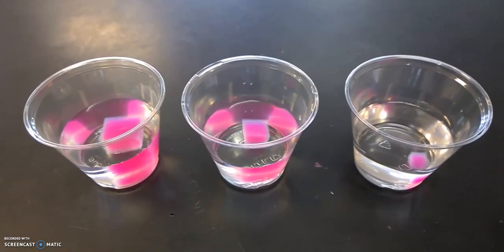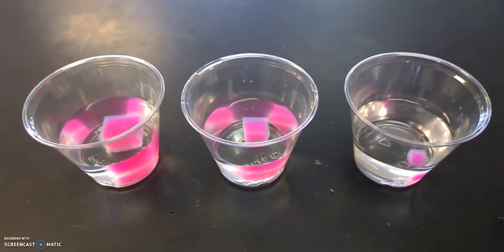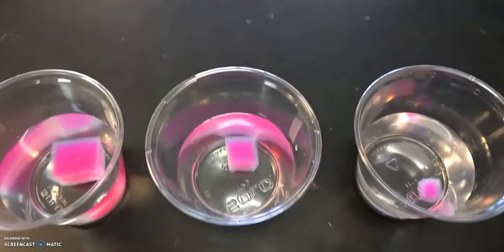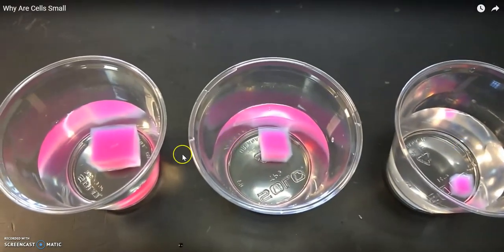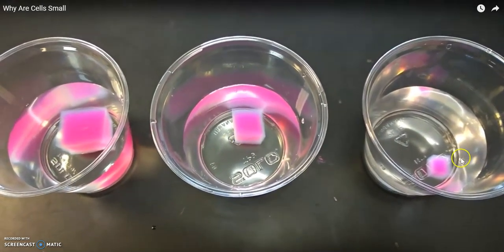Welcome back honors biology students. We are looking at the results of our mini video experiment. Here I've got my three cups with bleach and the beetroot cubes — two centimeters, one centimeter, and point five.